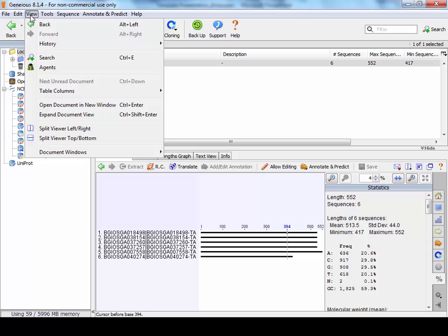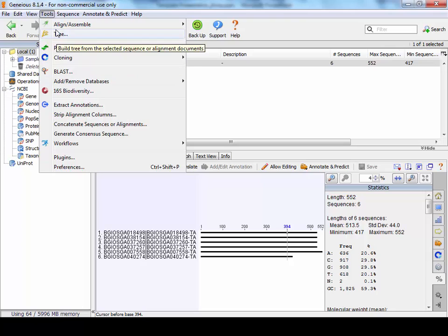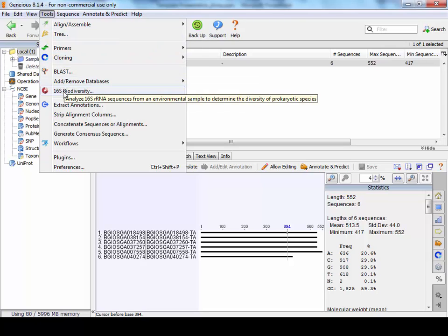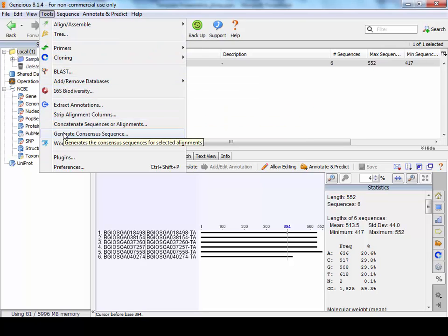In view, you can change the view settings if you want. In tools, there's blast and there's one or two other tools in here.